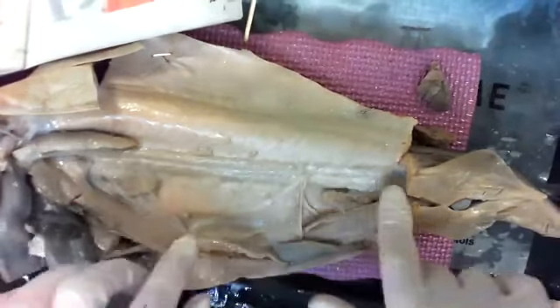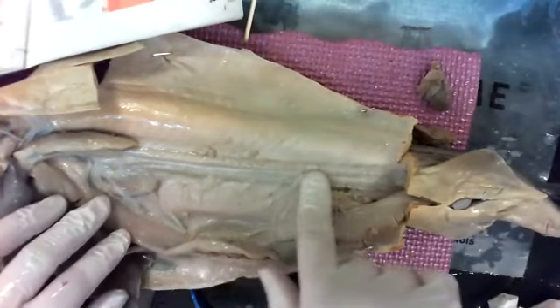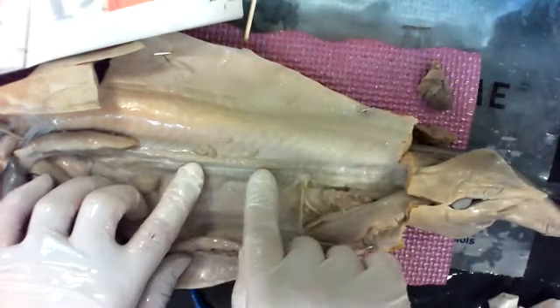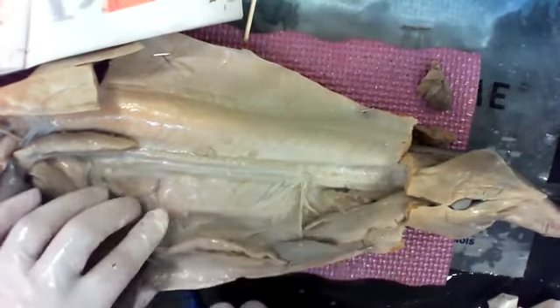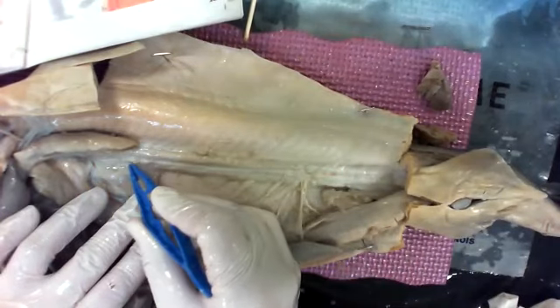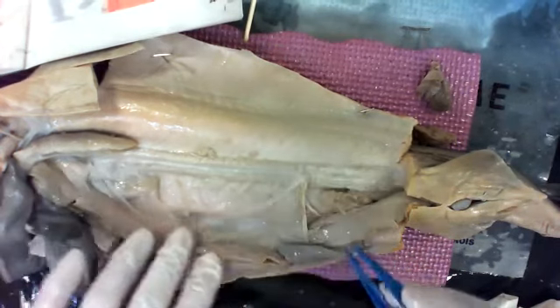Right? So when they develop and they grow the babies, if they hatch it internally, or they can push it all the way down and drop it out. Right? But you can see that pathway. In between these two pathways, as I push on this, I can kind of see bubbles going through the tubes. Those are blood vessels. That dorsal aorta is right there. I can see it, going all the way down the center, right in front of the vertebra.